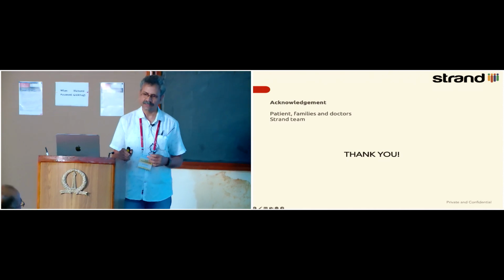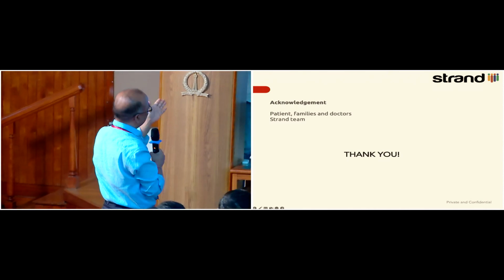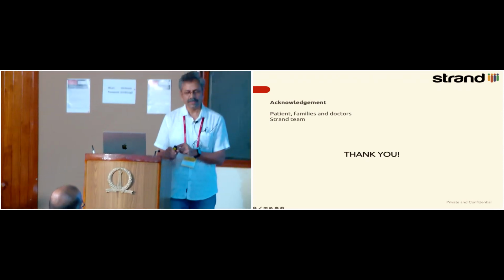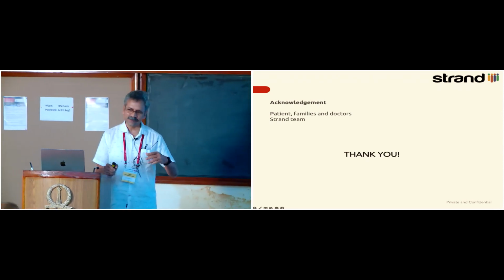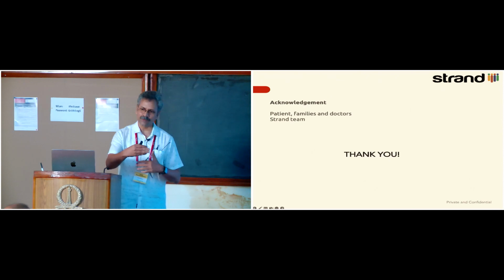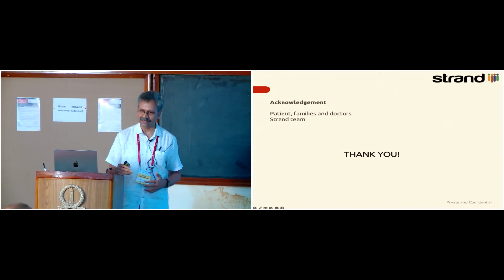I see. Okay, another question. In this CNV calculation, you're masking the repeat regions, right? Now, it all depends. You need to be consistent between your profile and your clinical sample. If you didn't mask it in the profile, and you're anyway comparing against the profile of 10 or 20 people that you already sequenced, then it may not matter.